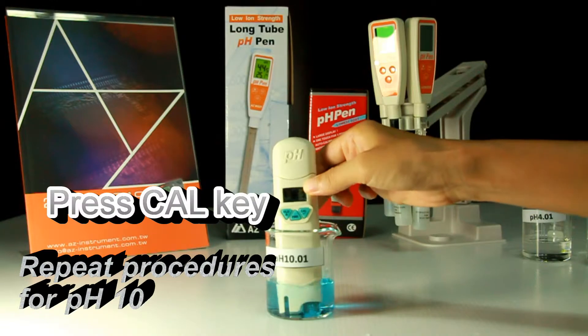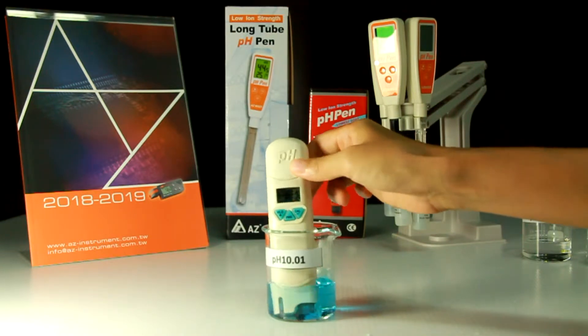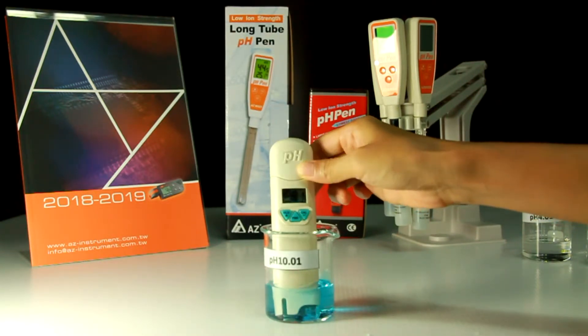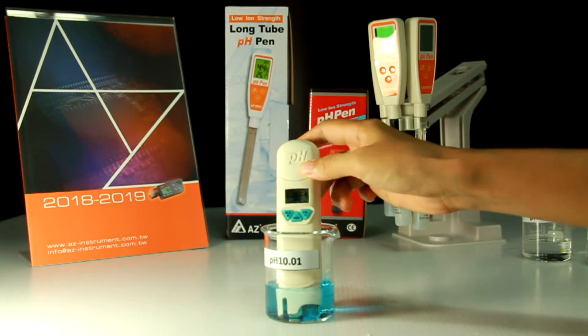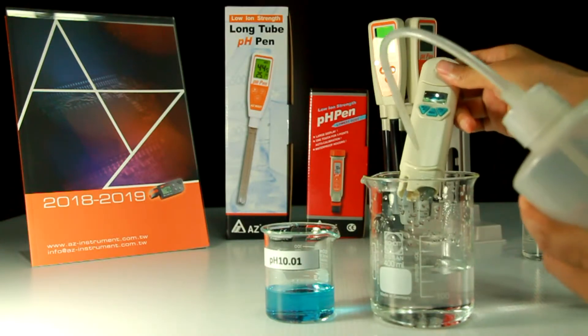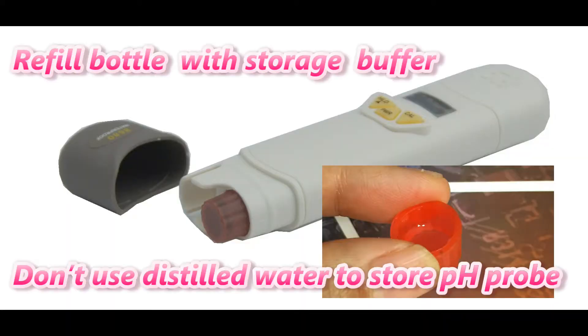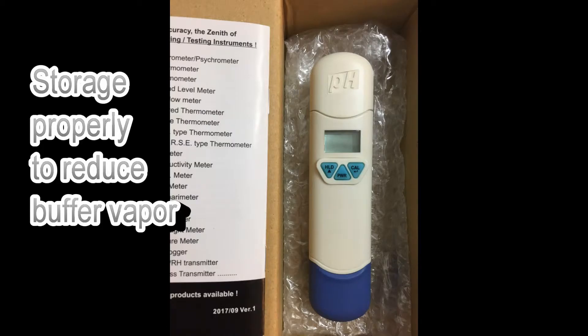For a 3-point calibration, repeat the above steps once more: press the calibration key again when the PH Pen is stable in the new buffer. Afterward, clean the electrode with water before immersing into storage buffer. If the storage buffer is dried, buy storage buffer locally to refill the bottle. In an emergency where storage buffer cannot be acquired immediately, use pH 4 buffer or tap water for temporary storage — do not use distilled water to store the probe. Keep the PH Pen in a cool place away from sun exposure to reduce storage buffer evaporation.